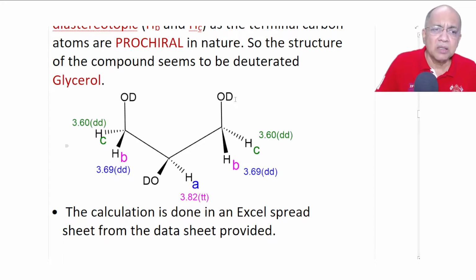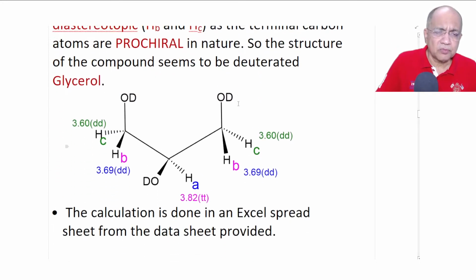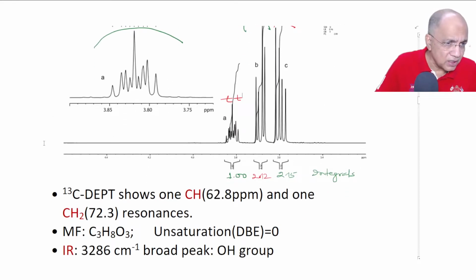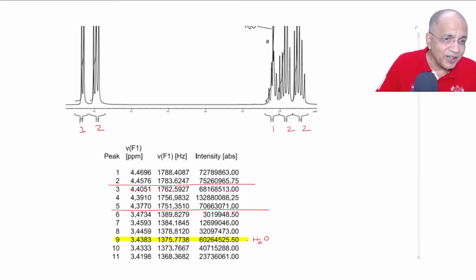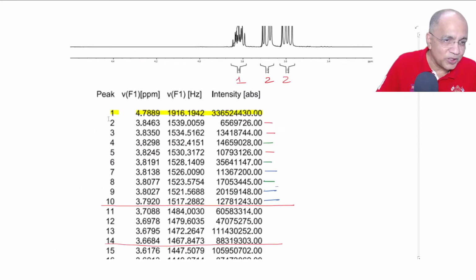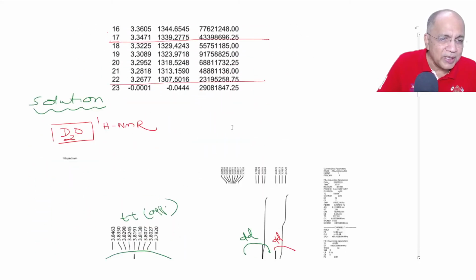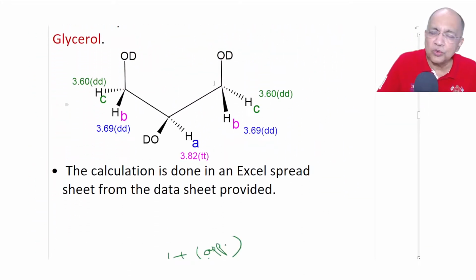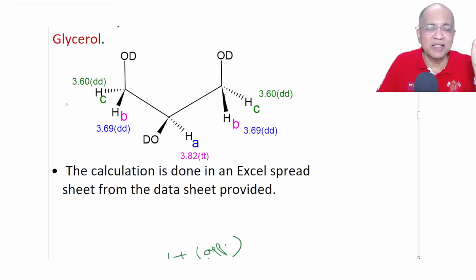But there is no impurity peak here, but yes, the small little peak which is not given in the spectrum, which we have ignored, might be due to some of the OH which is remaining as impurity, not completely substituted. So that is giving so weak intensity.